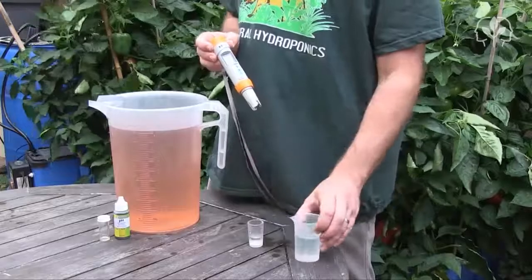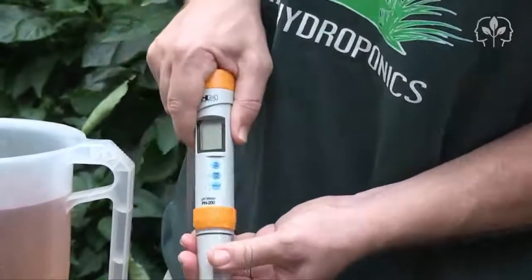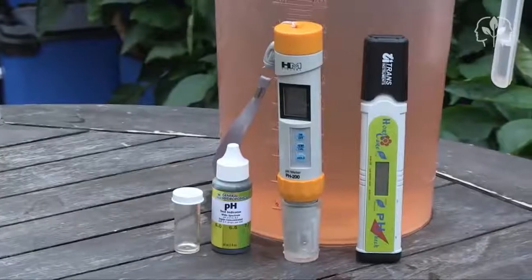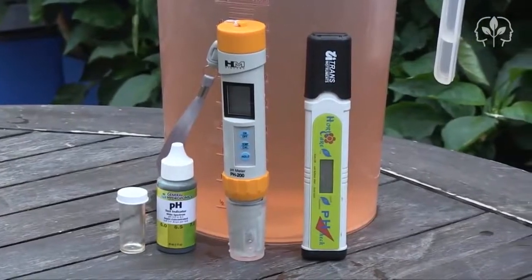Now that I'm done I simply pour in some storage solution and screw the cap back on fairly tightly. So the HordiCare read 5.7 and the HM Digital pH 200 read 5.81.